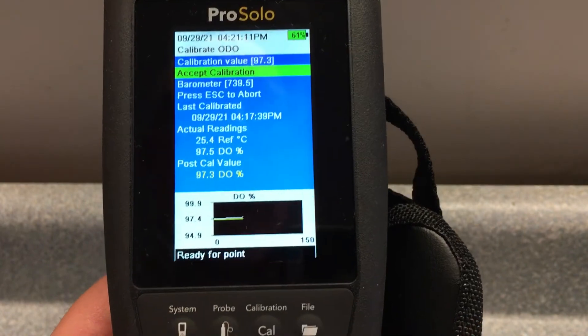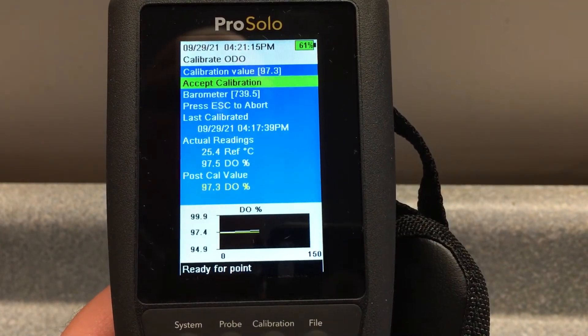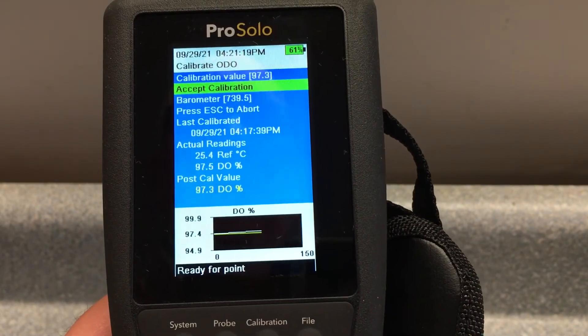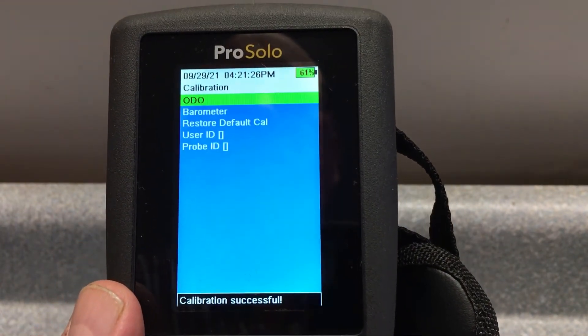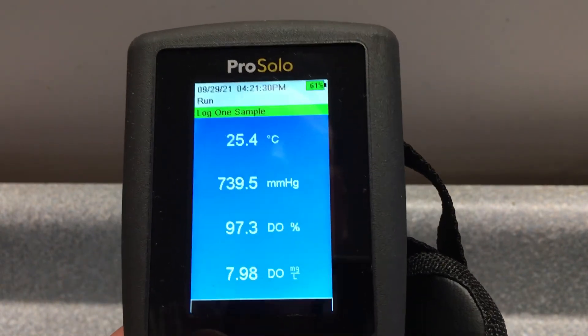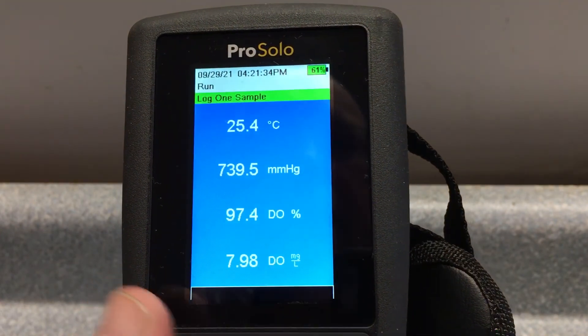We're going to let that go for one more second and then hit enter. It says ready for point — hit enter. It says calibrating sensor, and calibration successful. We can hit escape and we're now reading a live screen right there.